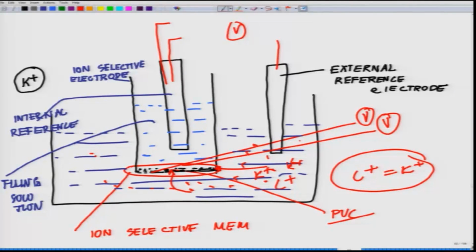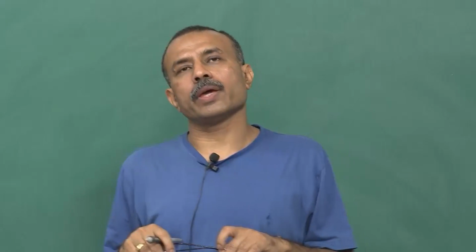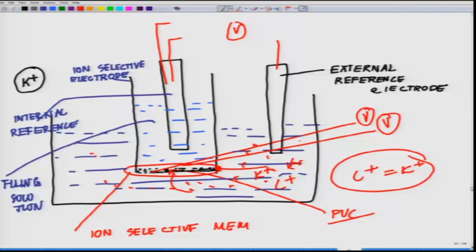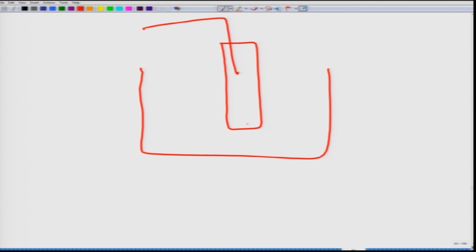If you remember, I told you there is no redox reaction as such taking place here. There is absolutely no redox reaction, but this is happening in a slightly different way. If you think of it logically, you have a beaker where you place your analyte, and a reference electrode along with your indicator electrode. You have an external reference and an internal reference, multiple references there. Now, you have a membrane out here. Across the electrode and outside, there is a potential which is maintained, delta E.